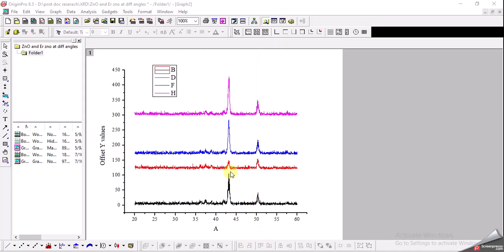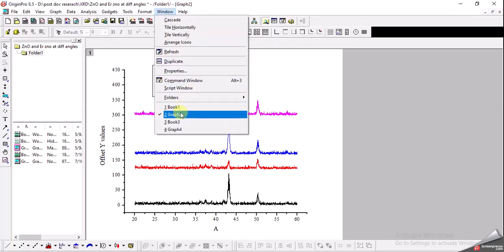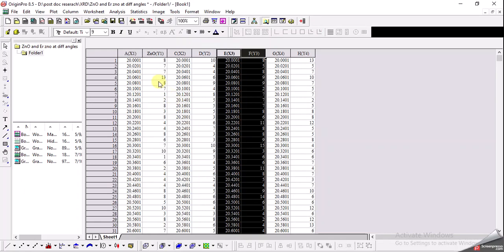For this reason, I had the data of this graph on Workbook 1. You can see that on the x-axis we have the angles, and we have the intensities of the first sample, then the angles and intensities of the second sample, and similarly for the third and fourth samples. I will be using only the data for three samples - this one, this one, and this one.